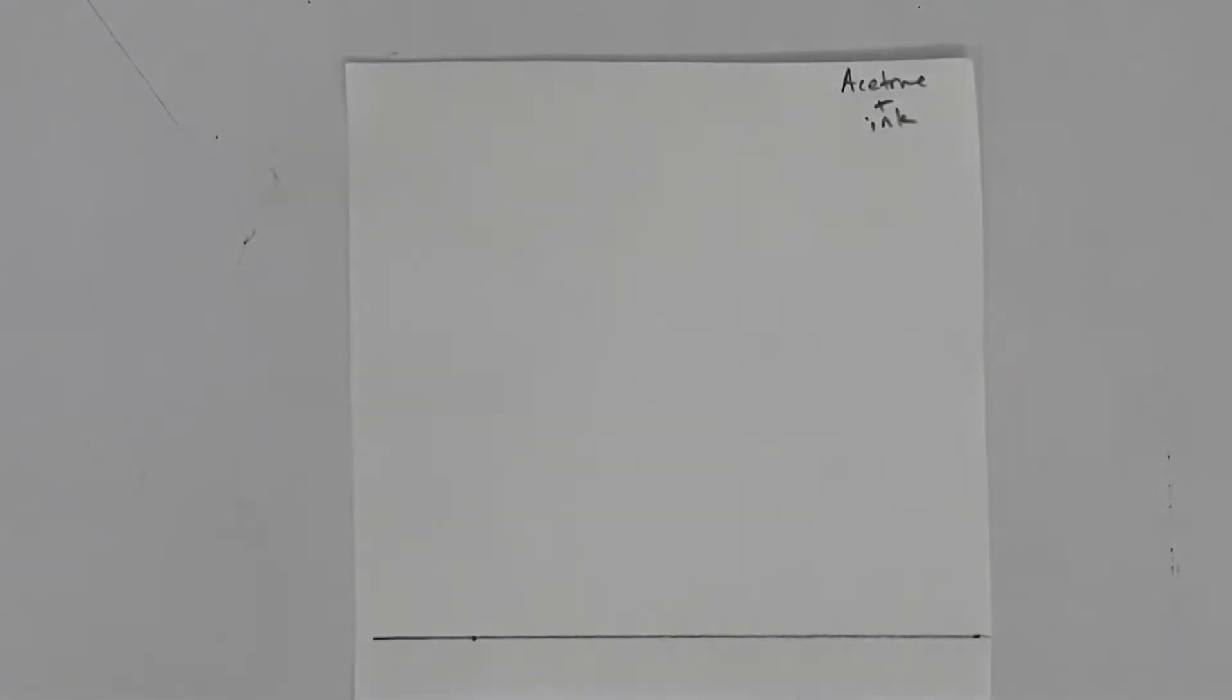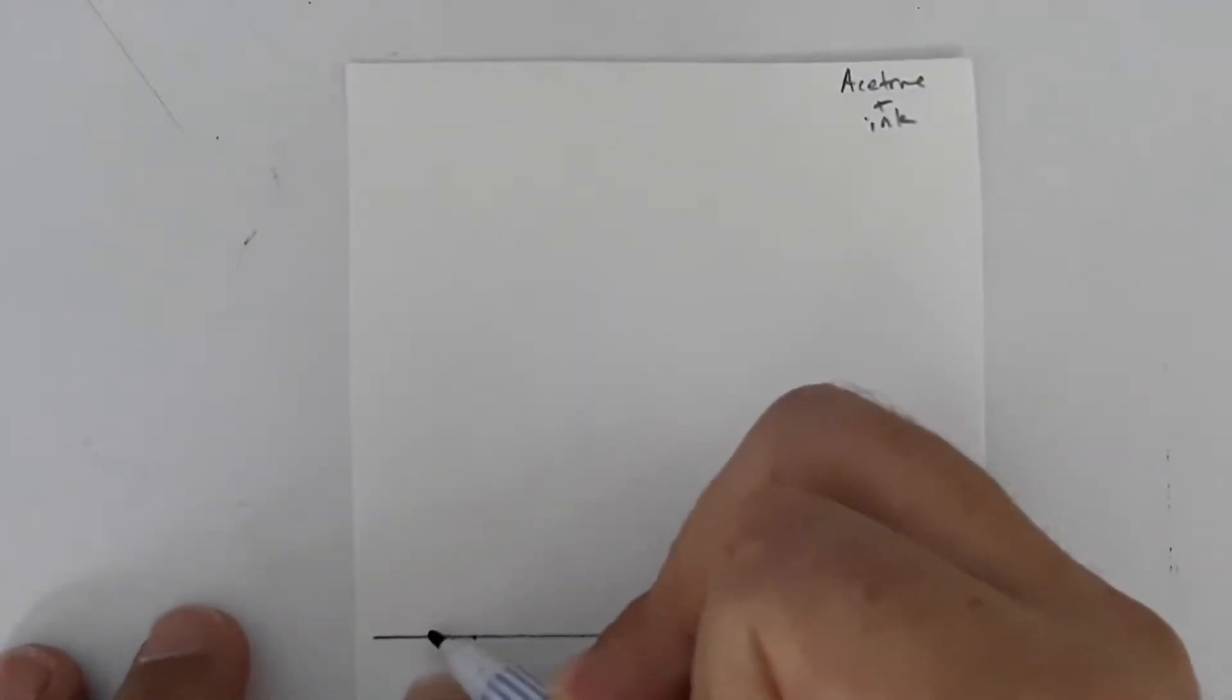We're going to be using several different colors of marker here. So I'm going to go ahead and spot the pigments onto the line. So here is black.